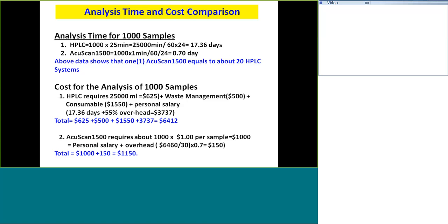But when you test an over-the-counter drug, you will realize 10%, 20% are not meeting the specs. But how could the drug company feel comfortable not to get sued or pulled from over-the-counter, which is a big risk for the pharmaceutical company, when they're not testing 100% of them, and some of them are over the specs or lower than the specification. Those are the issues we call quality assurance. So for the drug company to assure that all the drug they produce meets tolerance, FDA requires plus or minus 10%, and according to FDA guideline they could do 1-3%, and I'm meeting that. I have data to prove it. That could be just meeting the paperwork.